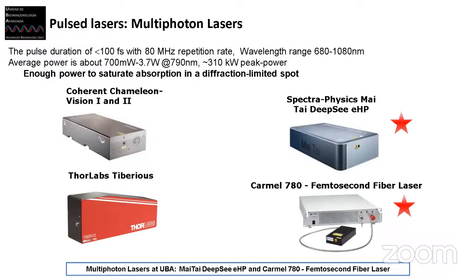Particularly, I want to mention that this is the laser that we will use in our practical session. You see here, and this other is also in the unit, but in the hospital with another microscope. And all these lasers can pulse at 80 megahertz, 50 megahertz, depending on the configuration. And these 3 can tune between more or less 680, 690 to 1080.